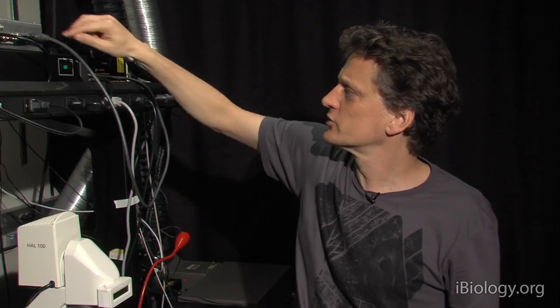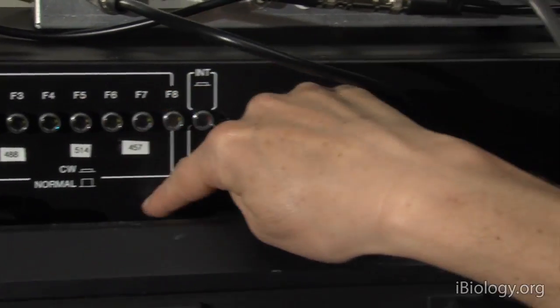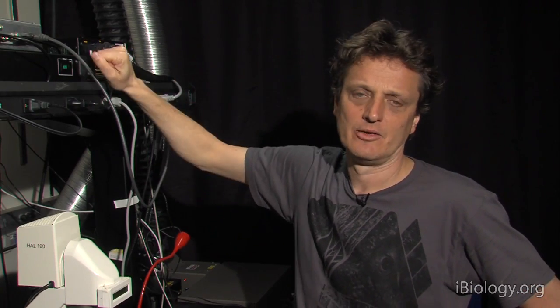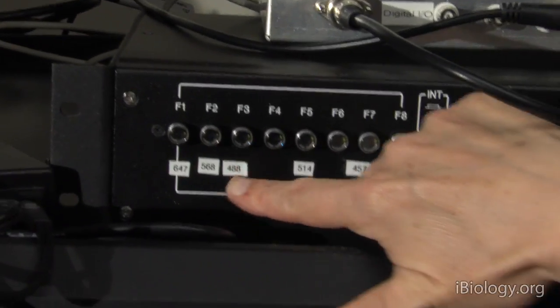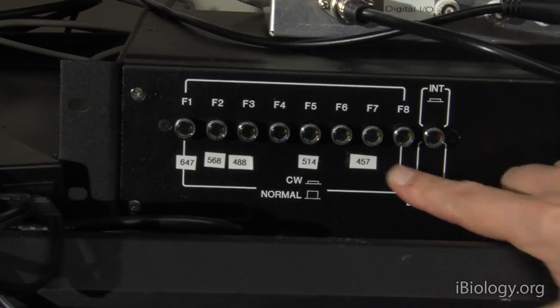This one controls the AOTF, an Acousto Optical Tunable Filter. And that is basically a very fast wavelength changer. So that AOTF is sitting there in front of the lasers in the back. And that will select, in this case, either the blue or the yellow line coming through. And can do that at microsecond timescales.